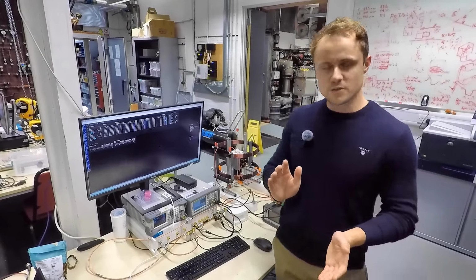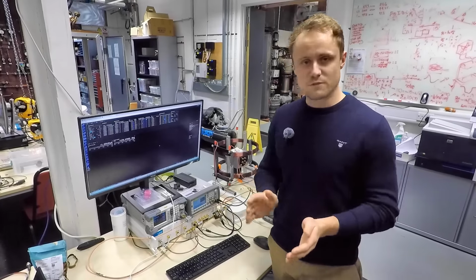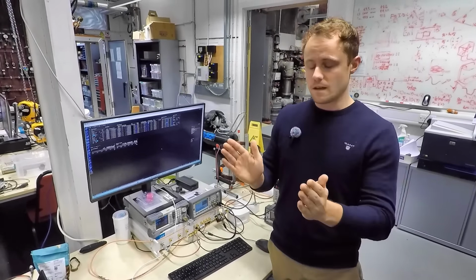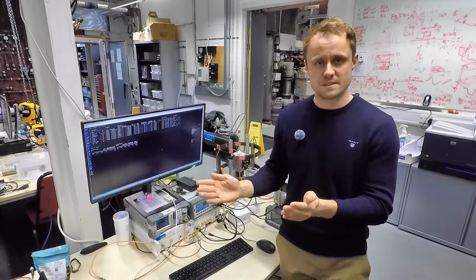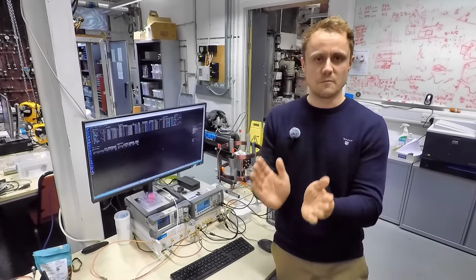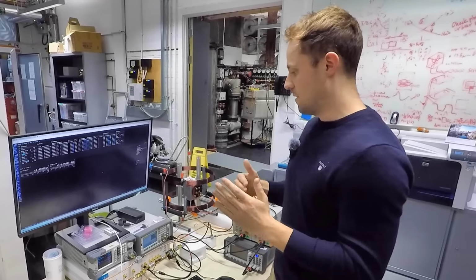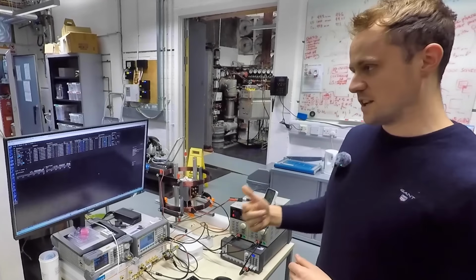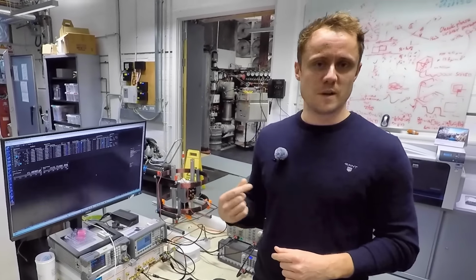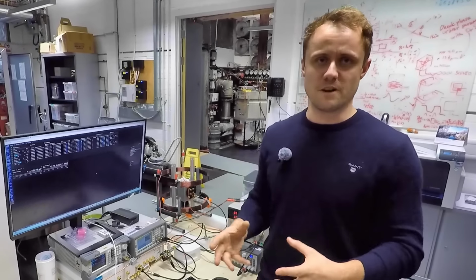So lock-ins can also do phase-sensitive detection, and the way that they achieve that is when they get their reference channel in, they will split it, and then phase shift one of those by 90 degrees, and then mix both of those independently with the signal input. So it does that by multiplying the two signals together. And again, like the mixer, that means that if you have the same frequency on both of them, that gets modulated down to DC. A lock-in amplifier will then also apply a low-pass filter, and this is what allows us to measure at a specific frequency with a very low noise.